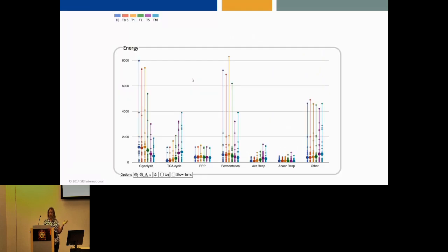On the earlier slide, I flashed you a picture of the top-level display, but you couldn't read it. So I'm going to take one panel as an example to show you just what we're doing with the data here. This is the energy metabolism pathway panel. It's divided into subsystems for glycolysis, the TCA cycle, et cetera.